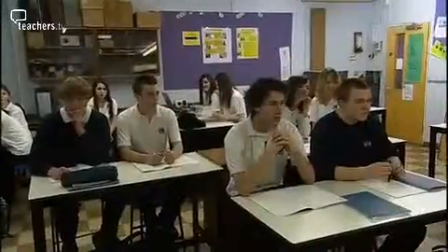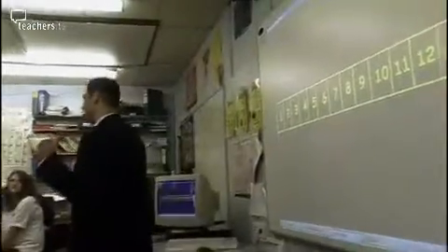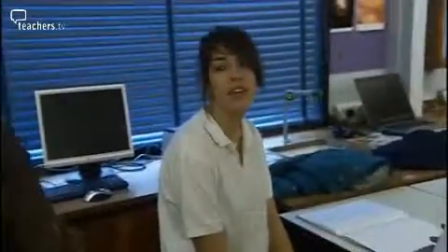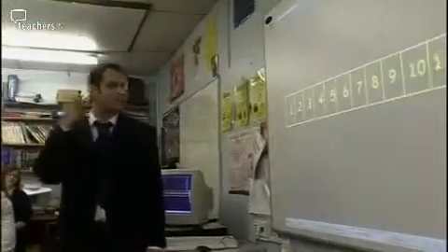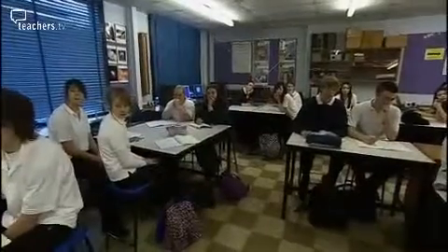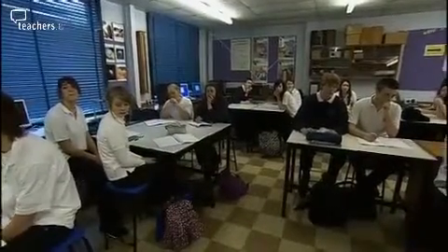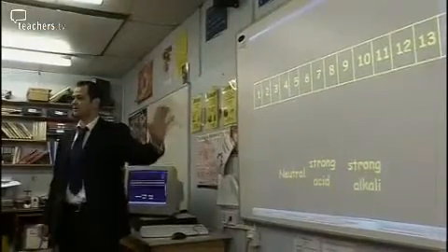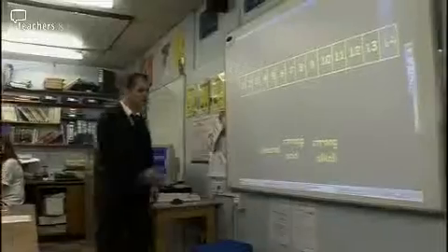What we're going to do now, can anybody tell me what is that? Jessica? Is it a pH scale? It is, thank you, well done. We've got 1 through to 14. Can anybody tell me then, where is the strong acid, the strong alkali, and the neutral part of this pH scale? It's neutral 7. It is, well done.